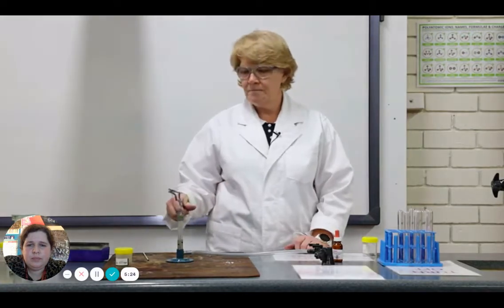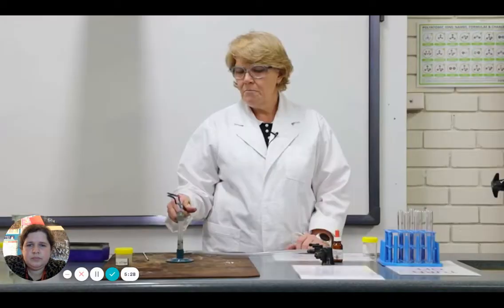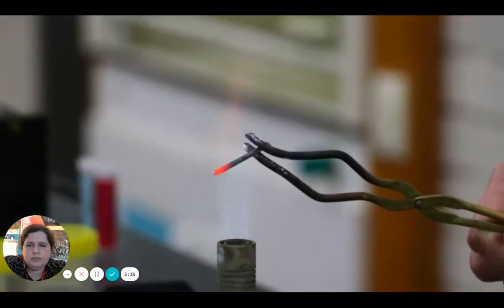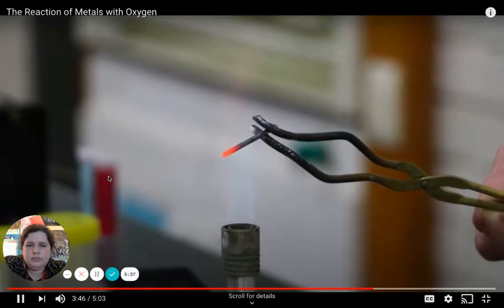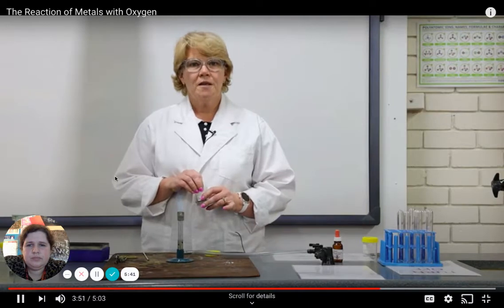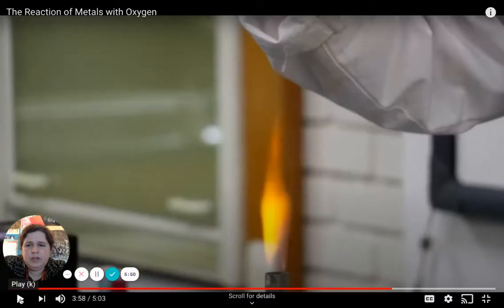Let's have a look at what happens when we put an iron nail into the Bunsen burner flame. Mostly, all that is happening here is that the nail is glowing red hot. So it's not changing. Now I'm going to sprinkle iron filings into the Bunsen burner flame. By increasing the surface area of the iron, I should be increasing the rate of reaction. So this is basically shaved down iron.